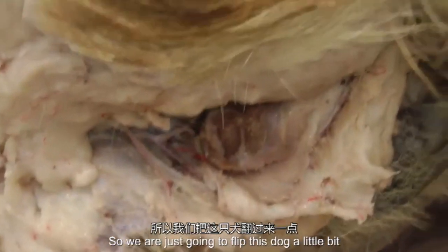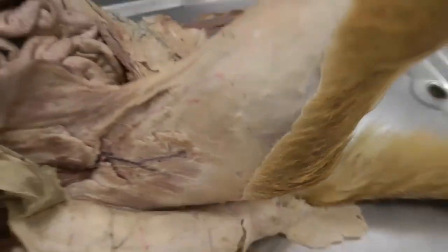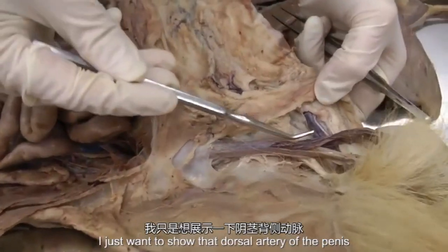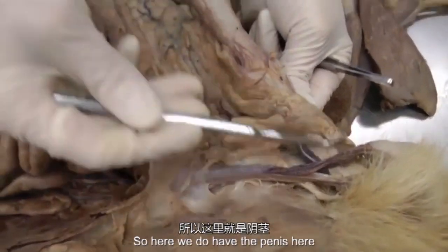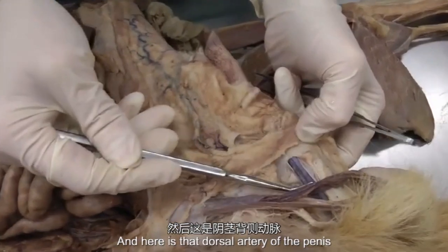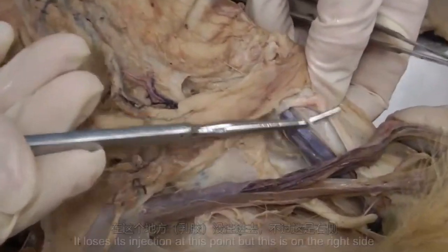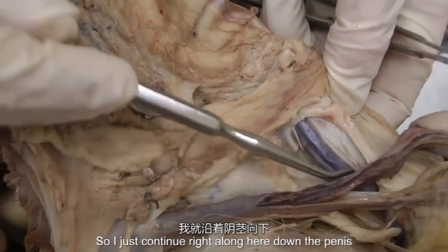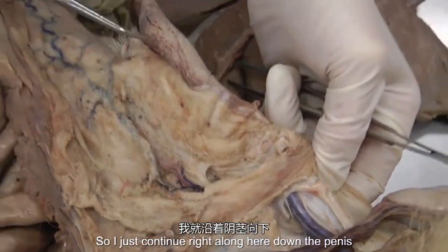So we're just going to flip the dog a little bit, and I just want to show you that dorsal artery of the penis. So here we do have the penis here. It's been taken out of the prepuce, and here's that dorsal artery of the penis. It loses its injection at this point, but this is on the right side. It just continues right along here, down the penis.